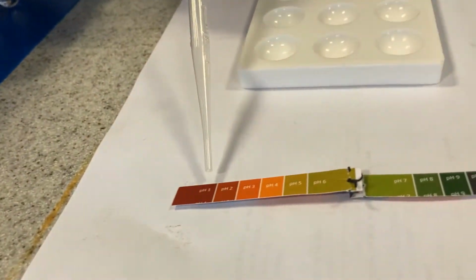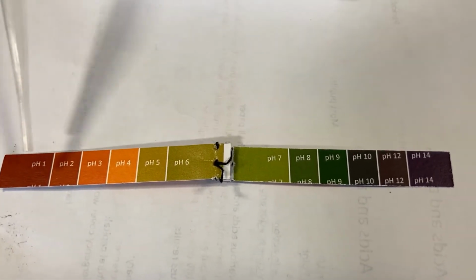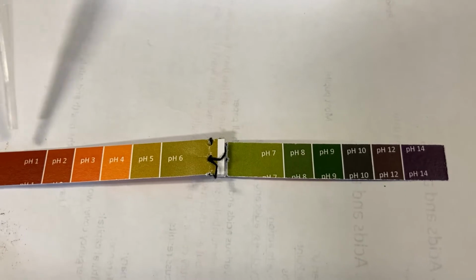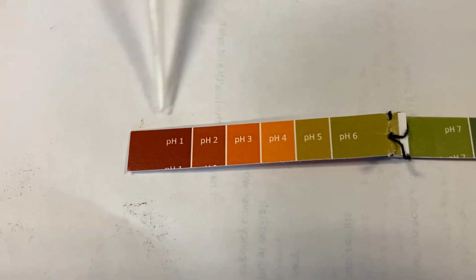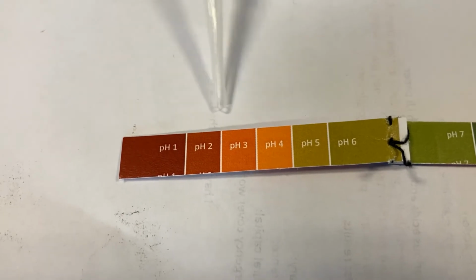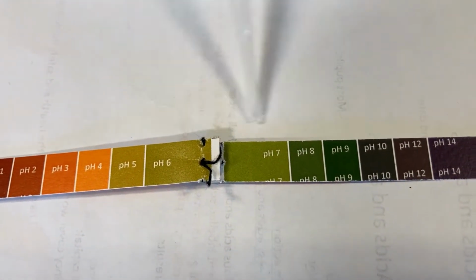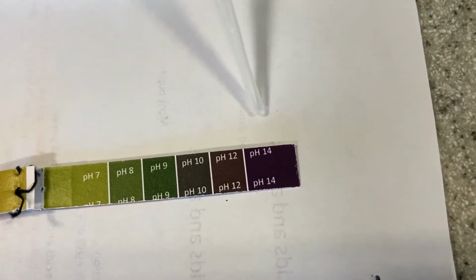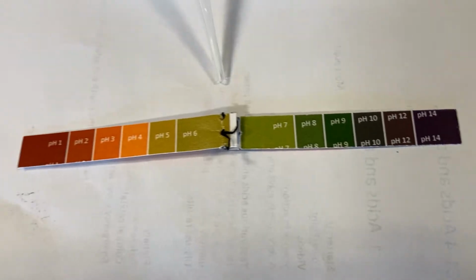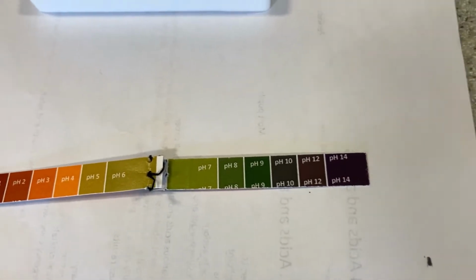Now this here is what we call the pH scale. The colours tell us how strong it is. If colours go this kind of end at pH 1, very, very strong acid. Over here we've got neutral, which is in the middle, and over here we've got alkali, very, very strong alkali. But they're on a scale. You've got all the different strengths in between. Let's have a quick look then.